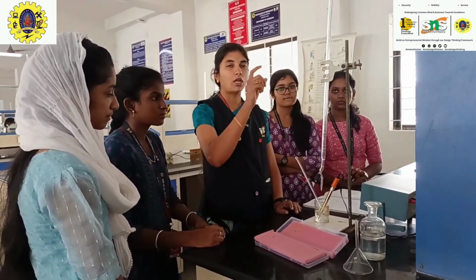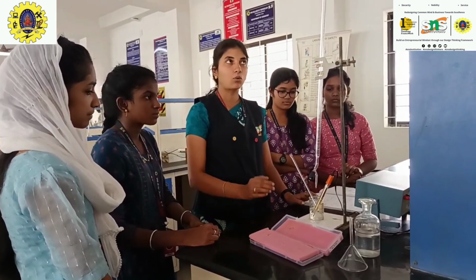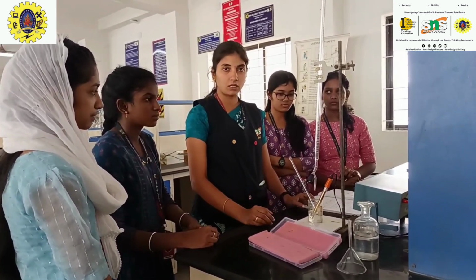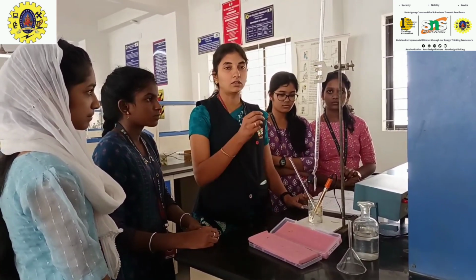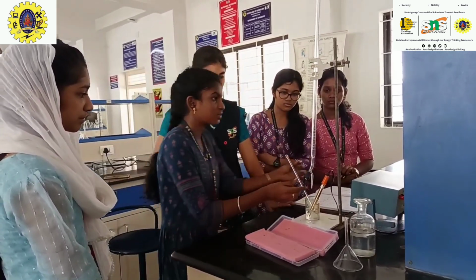For the next 1 ml, the value decreases from 6.34, and we add another 1 ml and titrate the solution.